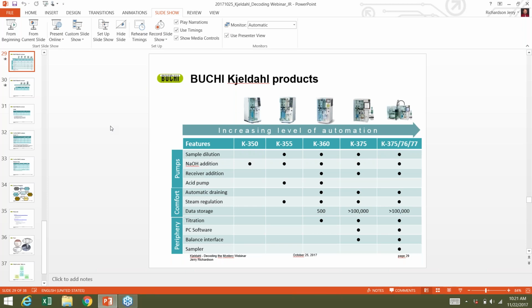That's going to, as you distill over the ammonia and or the additional water, and then that back titration is a secondary source of confirmation that you've reached the end point. Okay, but I'll contact you. We'll talk about that a little bit more offline and make sure that you're on the right track. There are a couple of questions I need to ask to get a clarification, find out exactly what's what.